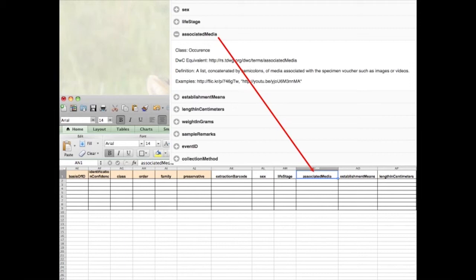Now that we have walked you through a few examples, please take some time to further familiarize yourself with the BWP Terms page. We want to reiterate that all blue columns must be completed to successfully gain access to the FIMS database and subsequently to move through the BWP barcoding pipeline. Additionally, all orange fields must be populated before these records will be labeled as barcode platinum, gold, or silver in GenBank. Once you have populated the fields required on the spreadsheet, you will be ready for the next step in the Informatics pipeline, validating and uploading your spreadsheet to the FIMS database. This will be explained to you in the next Informatics video.